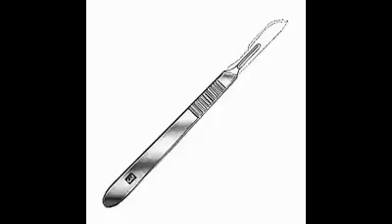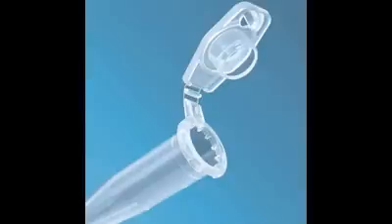You want to make sure that you have a clean, sharp scalpel to cut this out with, because you don't want any kind of contamination. So make sure that your scalpel is sharp and clean. And when you're done cutting it out, you want to place your DNA in the agarose gel. Place it into a 1.5 milliliter tube, just like this one. And then we're ready to begin extracting the DNA from the agarose gel.